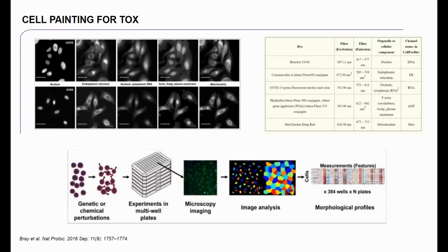And if you've already been involved at all in high content analysis, there's a very good chance you've already heard about this. So the idea behind cell painting is exactly that, a very rich assay with a lot of different labels that can be used to profile all sorts of bioactive molecules. So here's the idea, is that you can label cells with 5 different dyes.